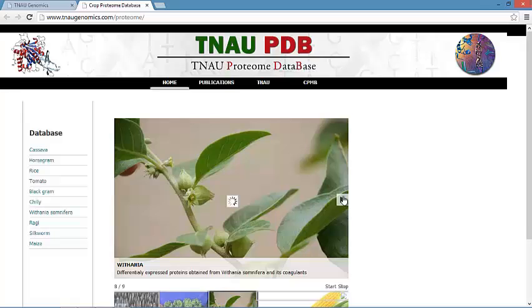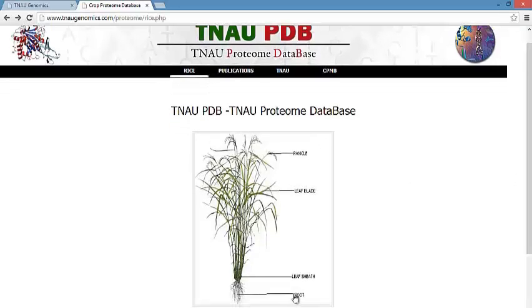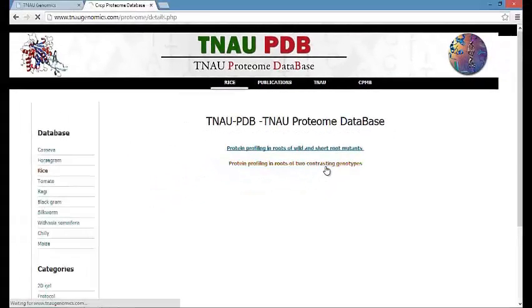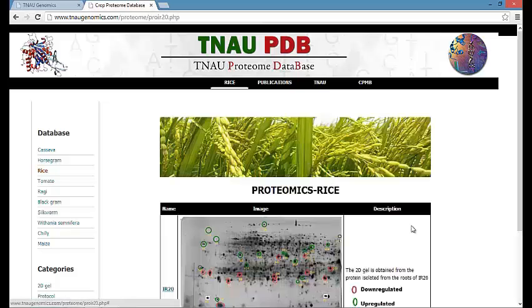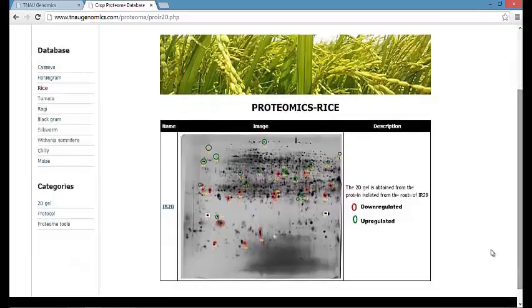Let us briefly see about the rice protein database. By selecting the root, it links to protein information. The protein profiling in roots of wild type and short root mutants, and protein profiling in roots of two contrasting genotypes are done. The spots identified are downregulated, upregulated, and positional change. The comparison is done between IR20 and Nutri-Pattu, mainly based on root penetration characteristics responsible for drought tolerance.